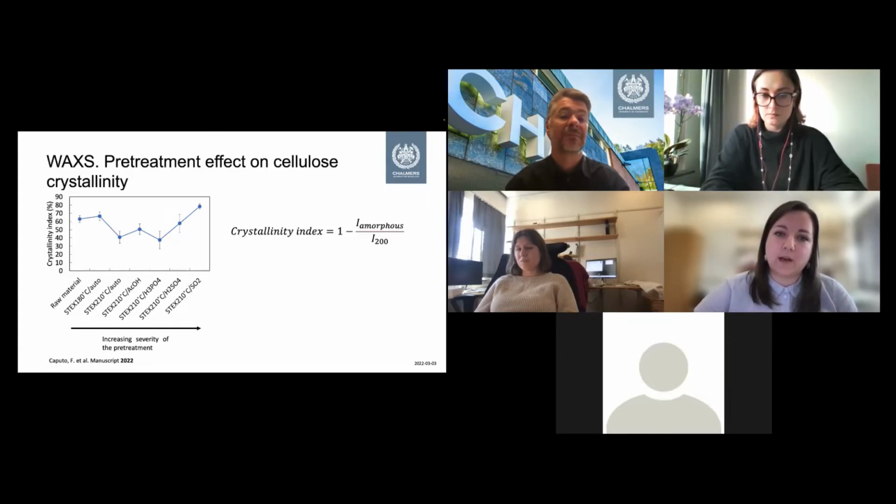So basically, if you have changes in both crystalline planes and amorphous planes, then you would not see changes in only the crystalline parts of cellulose.